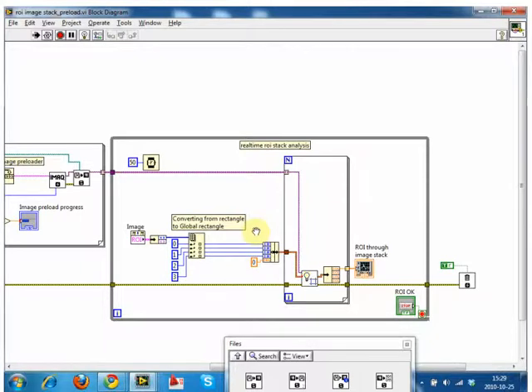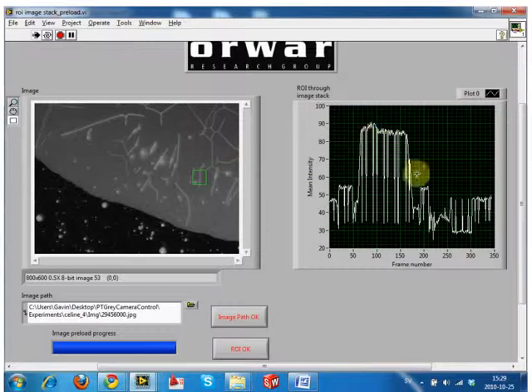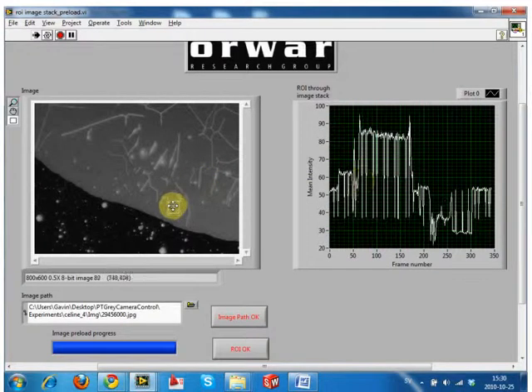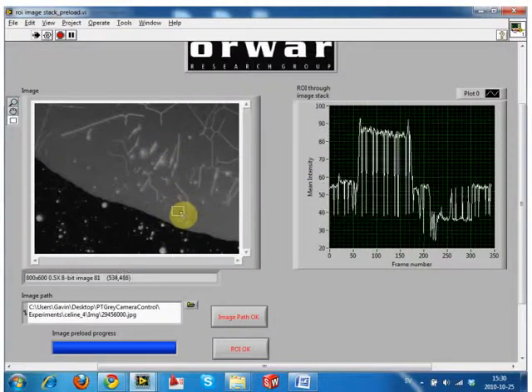And if you're seeing the right kind of information, you go, okay, that's where I want to be. But if you're looking for a particular event, maybe this event at whatever frame 150 means that something happened that you didn't want to happen, well, you're in the wrong spot. You want to keep moving around until you find the spot. Essentially, it allows you to keep hitting the right button. We want to move this guy around and find the location that works best.